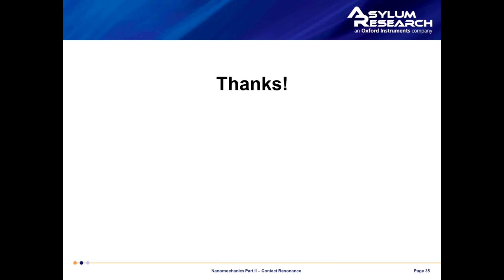The first one will go to Donna. The question, Donna, is what is the effect of roughness on contact resonance measurements? Thanks, Ben. That's a really good question. As with any contact technique, our signal in contact resonance is also sensitive to the contact area between the tip and the sample. So roughness definitely does affect the signal.